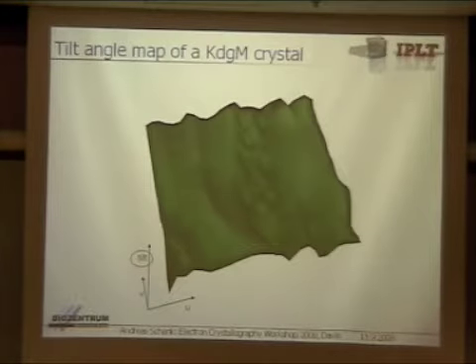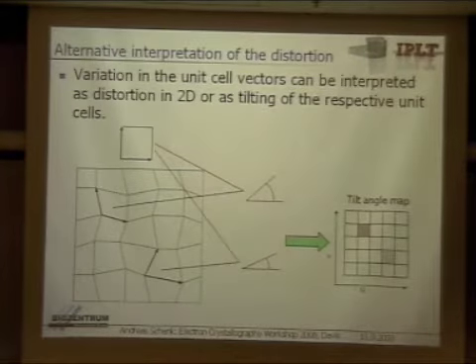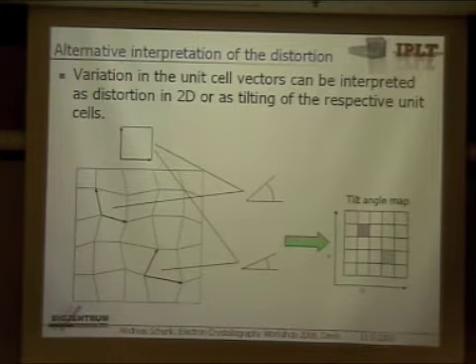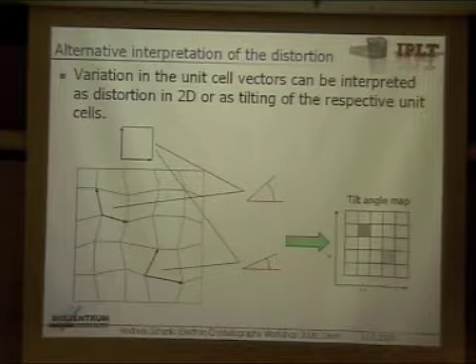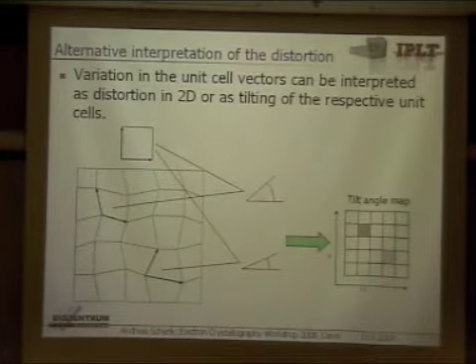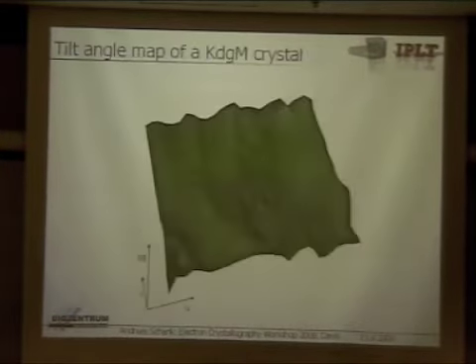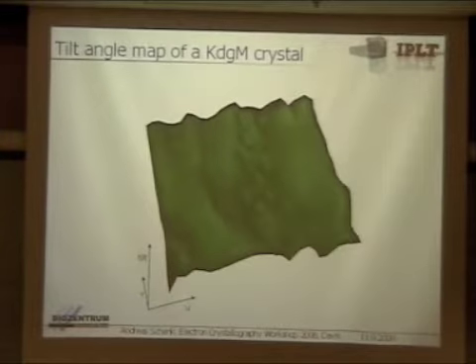Yes, that's the problem. Here you have the assumption that it's a defect in the crystal, or you assume that it's tilted. You cannot do both, at least not with one image. People in Madrid went in that direction. If you take the crystal image at 2 different tilt angles, then you can identify both. Then you have enough data. But just from one projection, you cannot distinguish. So, in fact, this might be a mix of distorted crystal defects and tilt.